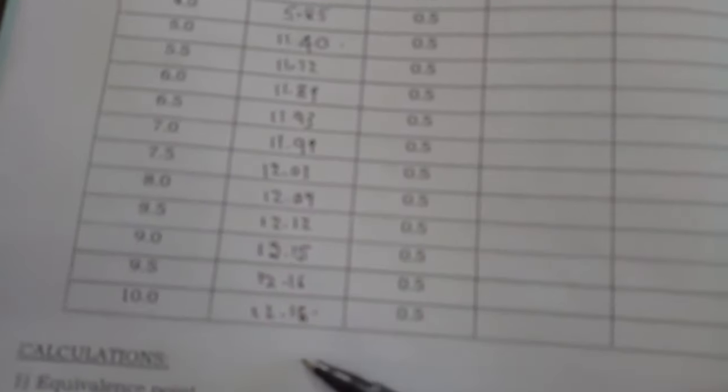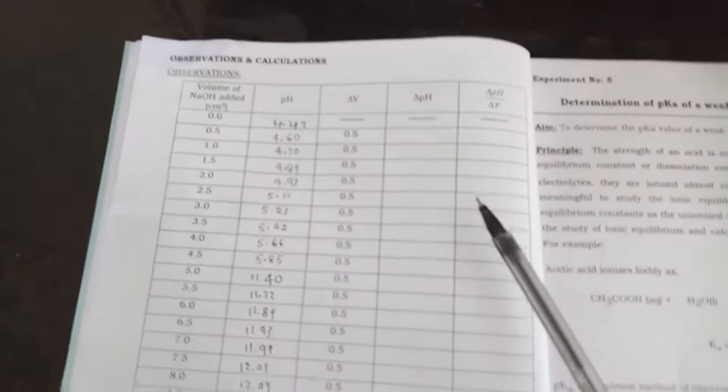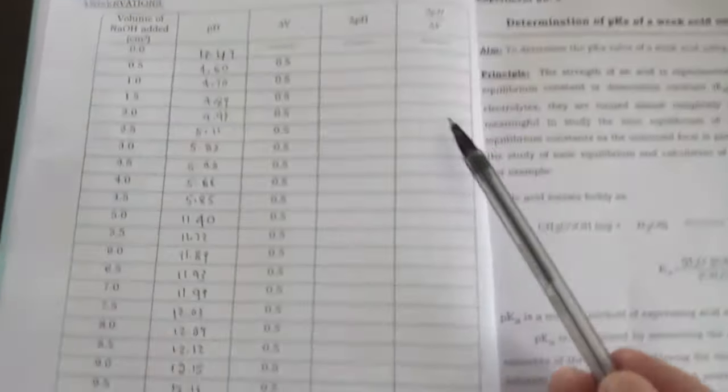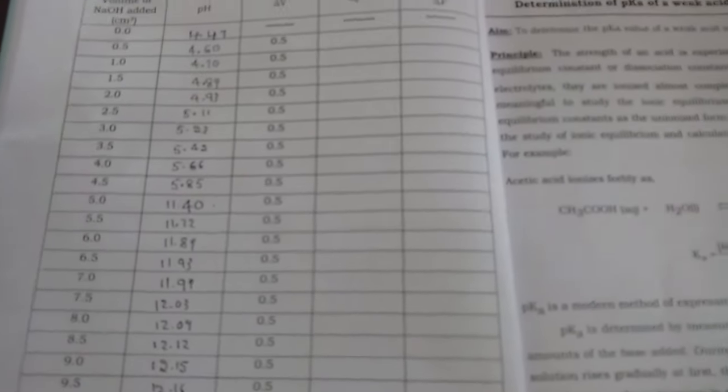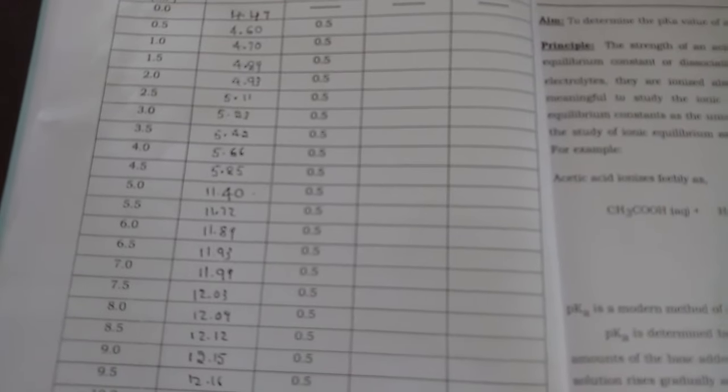Now here we can see near the end point there is sudden change in the pH, from 5.85 to 11.40. Then further there is slight increase in pH upon adding NaOH. So using these values we can calculate delta pH and delta pH by delta V. Based on that we can draw the graph.